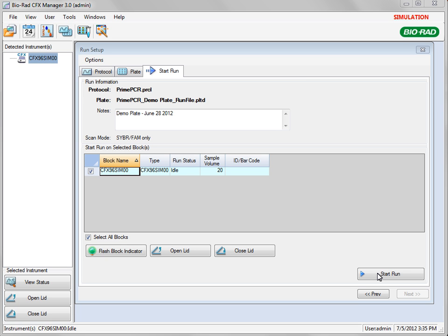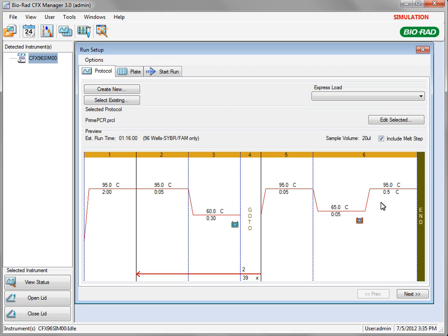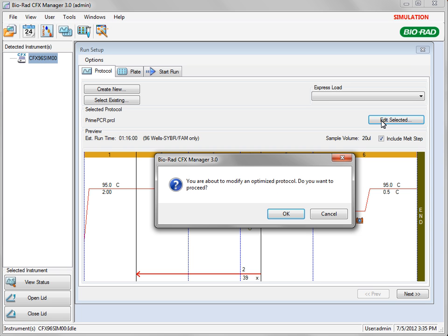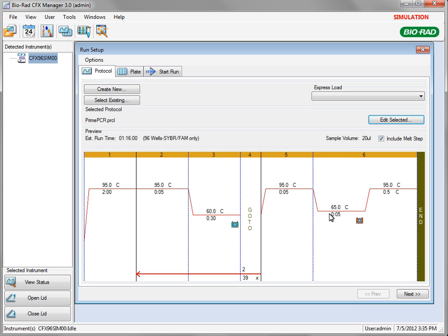To view or make changes to the protocol at this time, click the Protocol tab and select Edit Selected. PrimePCR assays have been validated and run optimally using the default protocol. A window will appear advising you of this. Click OK to continue with edits or cancel to close this window and return to the Protocol tab.